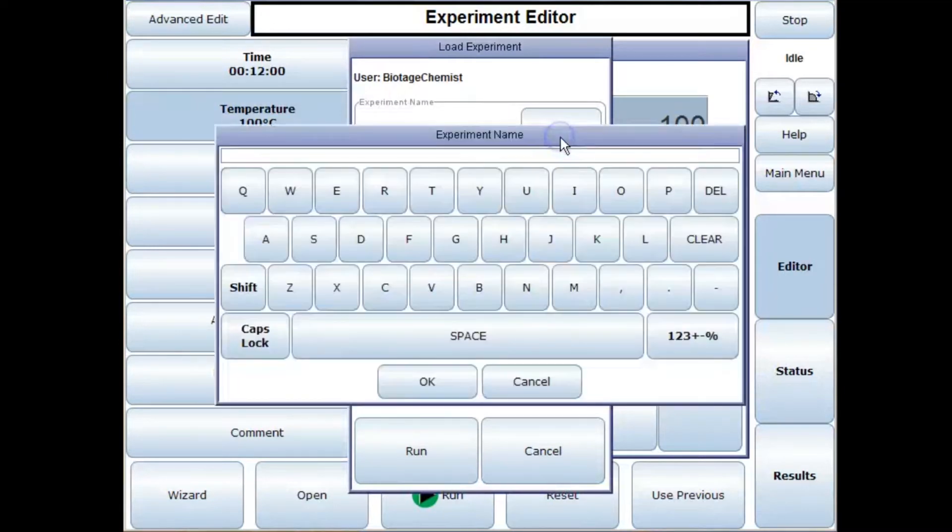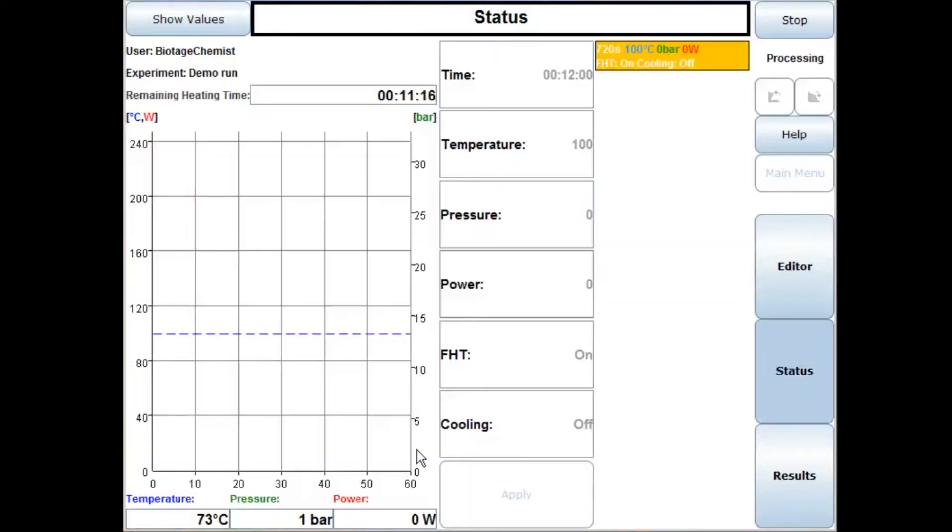And then we give our reaction a name. Then we press run again and our reaction is underway.